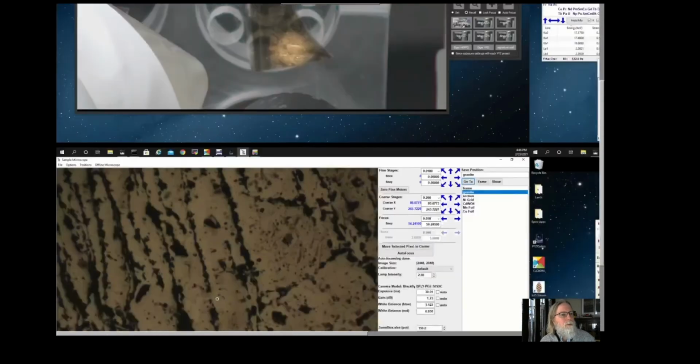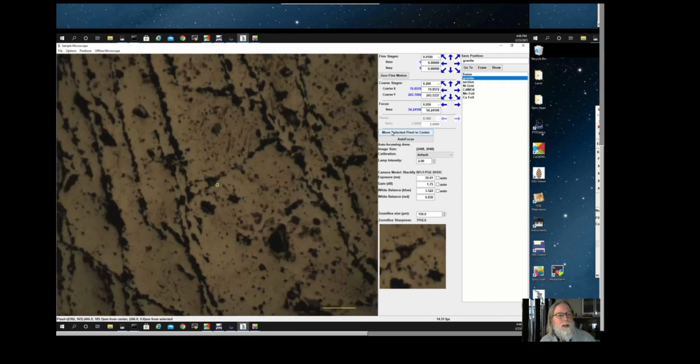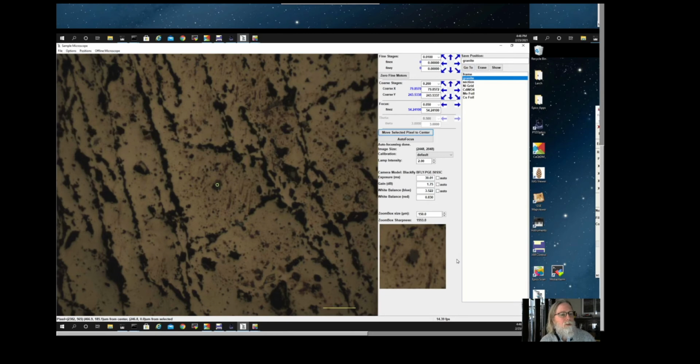Now that we're on this position, we can use other applications to look at the data coming off of that particular sample. But for now, we can just say, well, that's an interesting point. Let's move to there and maybe look at the fluorescence spectrum from there.